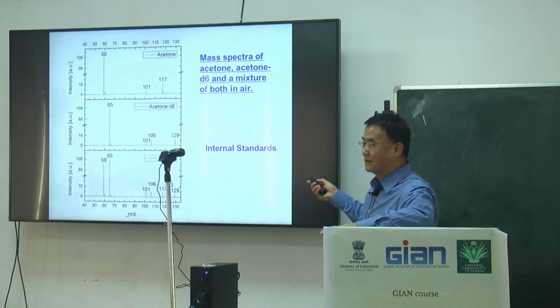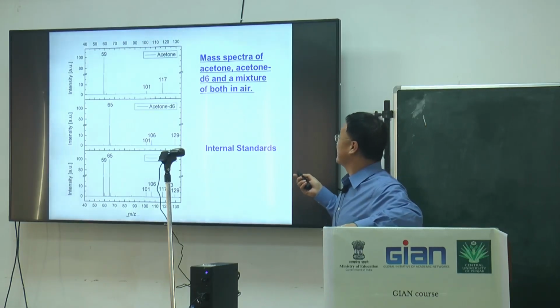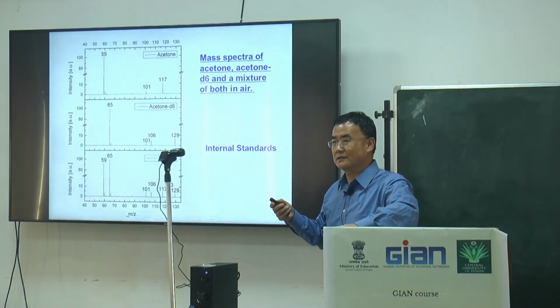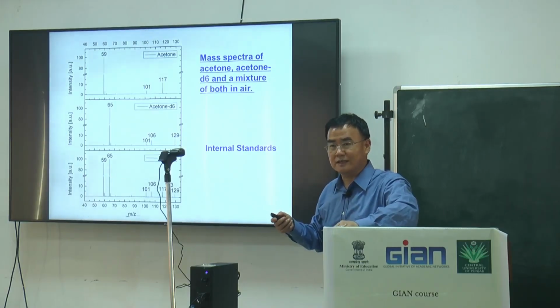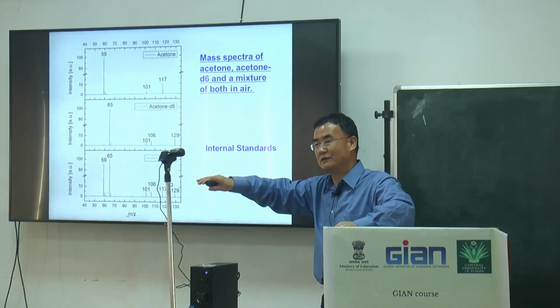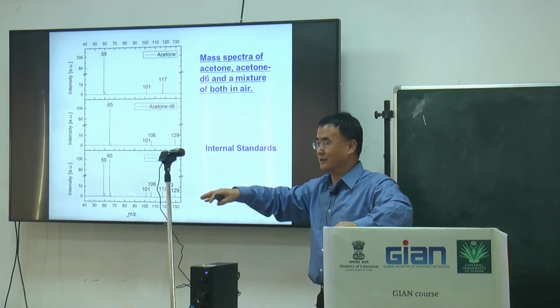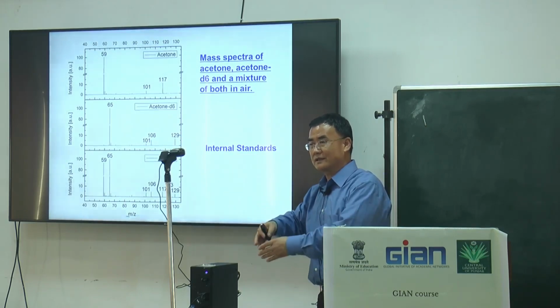The stable isotope standard is very important for hormone analysis. For hormone analysis, people only accept high-level methodology papers that use isotope-labeled chemicals as a standard.